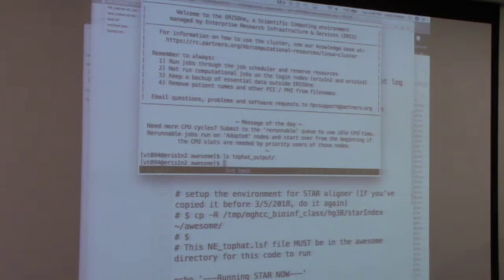So I don't have the FastQ files. I'll send you over R1, I don't know. I'll figure it out later. Oh, maybe the spelling, rescue file stuff. You don't have your FASTQ files in there.